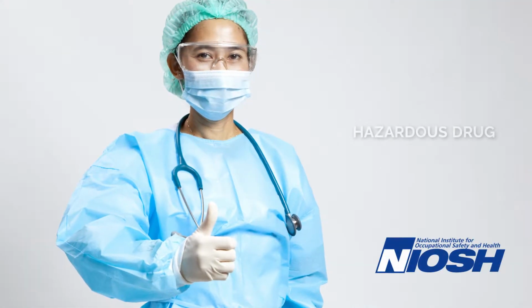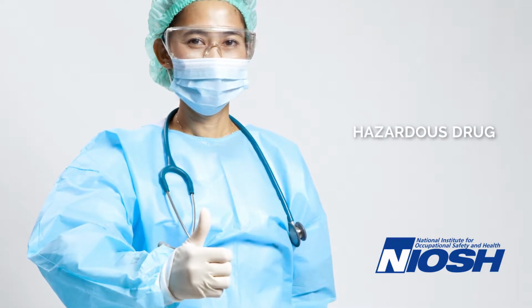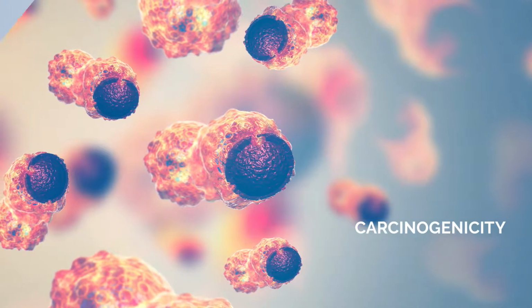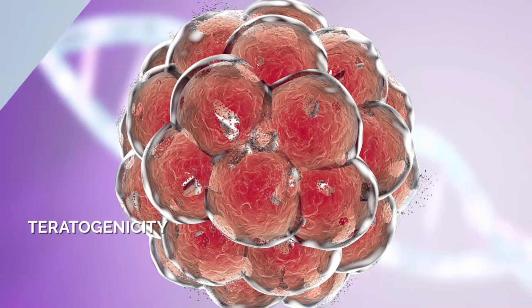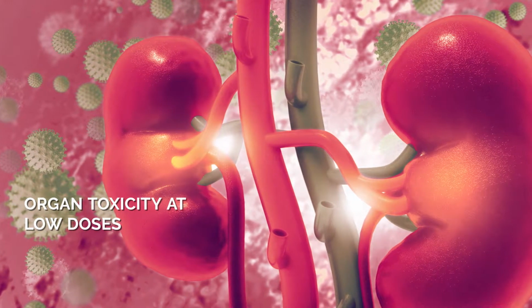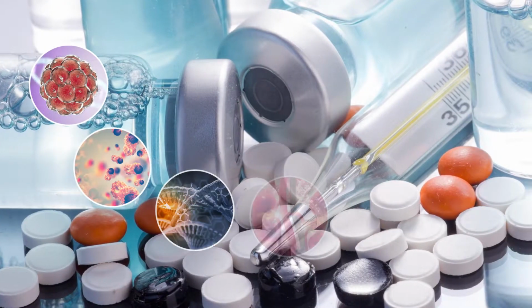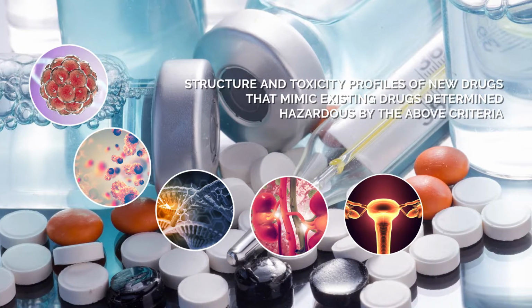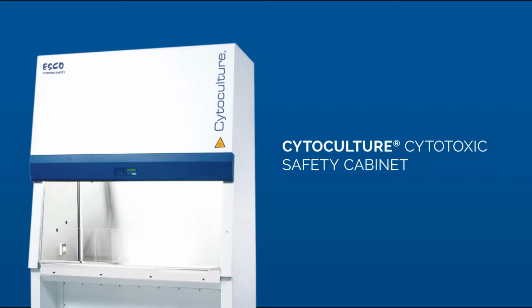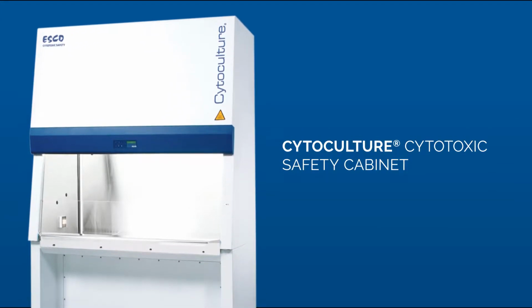According to NIOSH, drugs considered as hazardous include those that exhibit one or more of the following 6 characteristics in humans or animals: carcinogenicity, teratogenicity, reproductive toxicity, organ toxicity at low doses, genotoxicity, and structure and toxicity profiles of new drugs that mimic existing drugs determined hazardous by the above criteria. It is therefore critical that anyone who handles these drugs is adequately protected and must observe safety procedures.